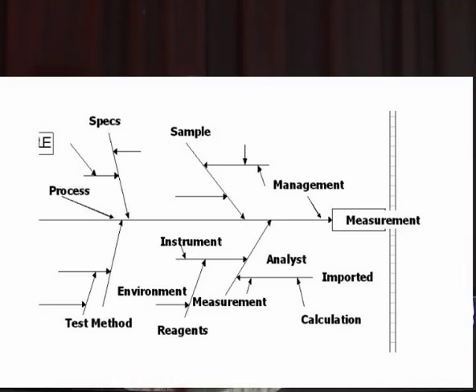The sampling implements, are they appropriate? Have they been cleaned? Have they been used properly? Have they been stored properly? The sampling environment. So all this contributes to the validity of the measurement.